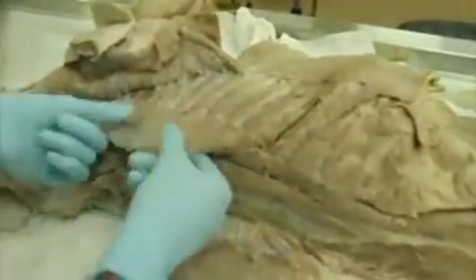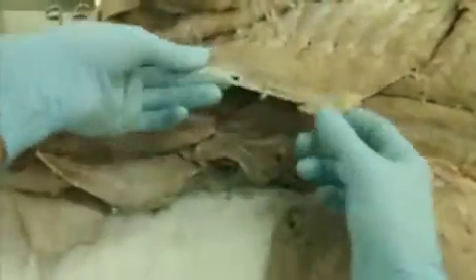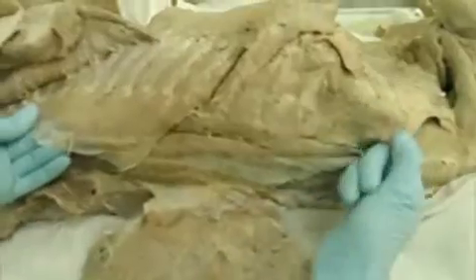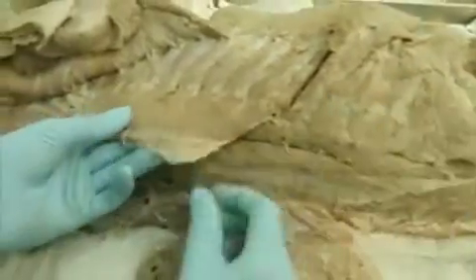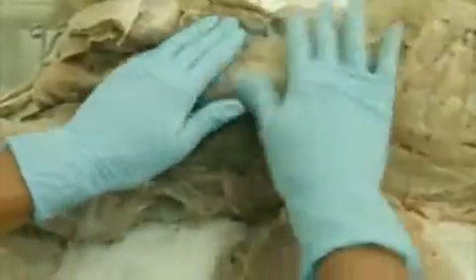Alright, I guess we can start with the back muscles. So I'm going to reflect the serratus dorsalis cranialis. There's actually a caudal part to this because this is the cranial part. Caudal part is often here, but sometimes it's hard to find. It's kind of intertwined with fascia, and I couldn't really find it in this specimen. But there is a general caudal part to the serratus dorsalis. We'll reflect that. So as we know, there's 3 parts to the back.